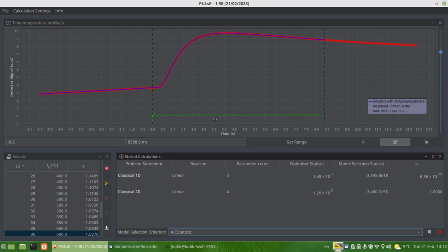And it can be strictly shown that in that case, and in that case only, the solutions of those two models actually overlap. And obviously, if you have conditions which say that you don't have very active heat losses, such as at low temperatures, then the model of choice would be the one that doesn't have so many parameters that can influence the solution.